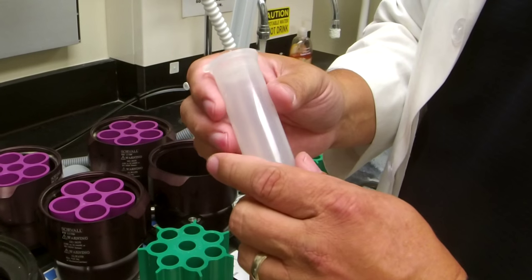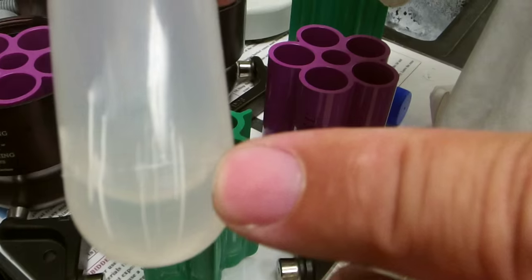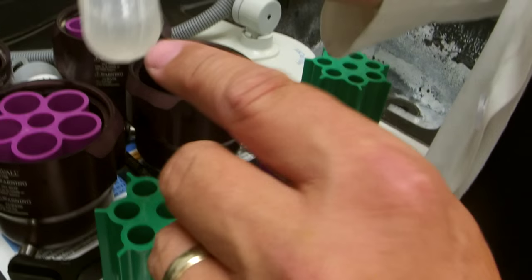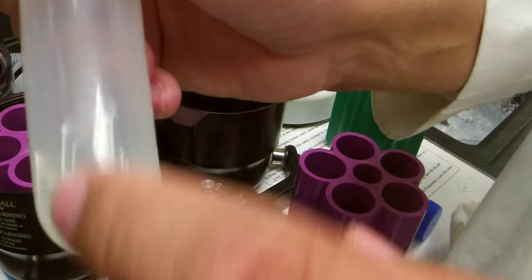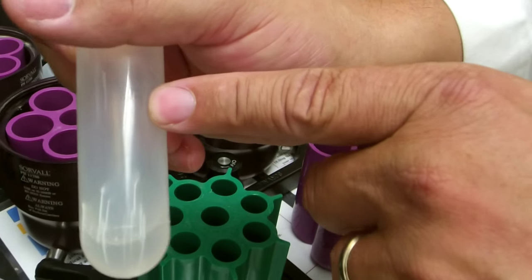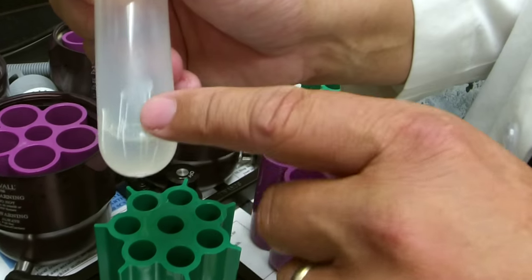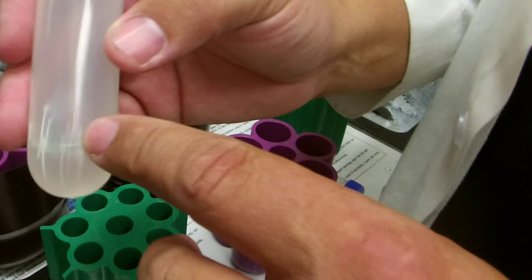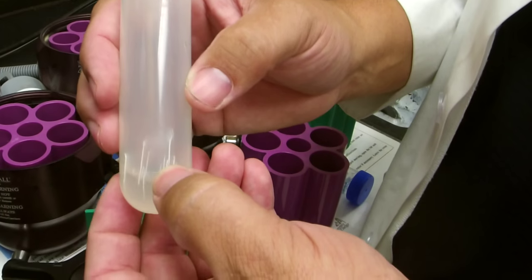There is also a minimal volume requirement for all these tubes. Here is a tube that was centrifuged with a very small volume. When centrifuged, the liquid went against the outside wall, leaving the inside unsupported, and the plastic actually started cracking — so this tube is no good. If you see cracks or stress marks like this, it's because the tube was run with a very small volume. You want tubes at least halfway filled, especially for higher speed runs. With low volume, you can't run it — you have to find a smaller tube and use an adapter.